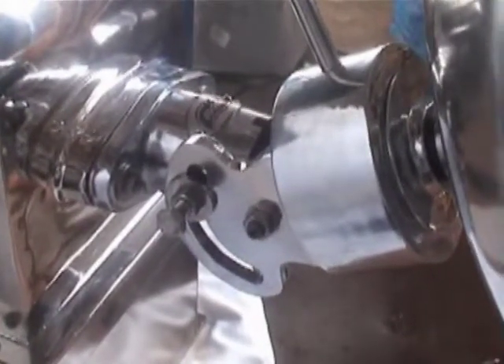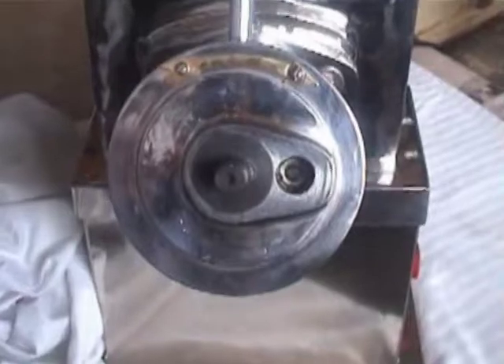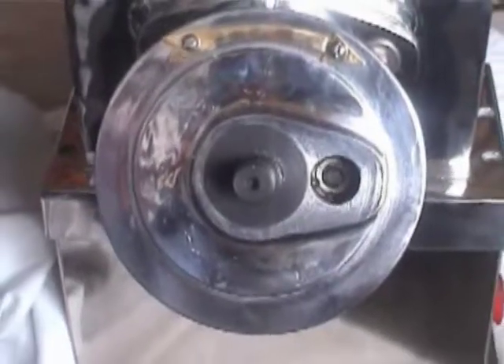Here is where you can adjust the angle of the pan. This is the universal gearing which was attached to the coating pan.